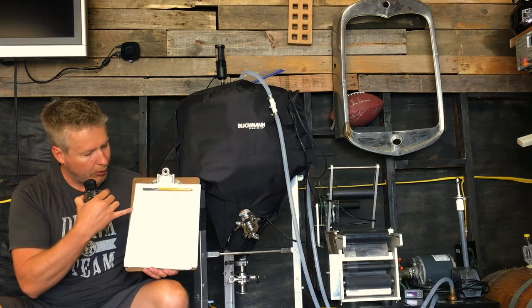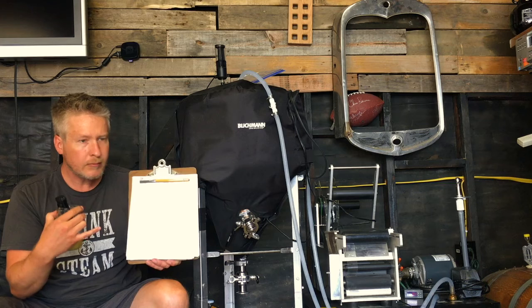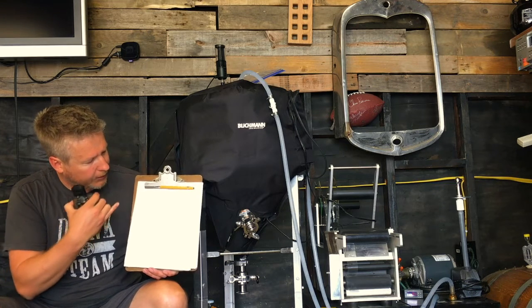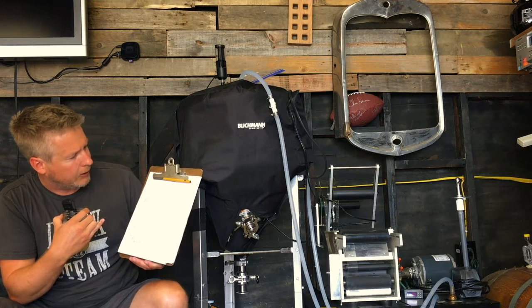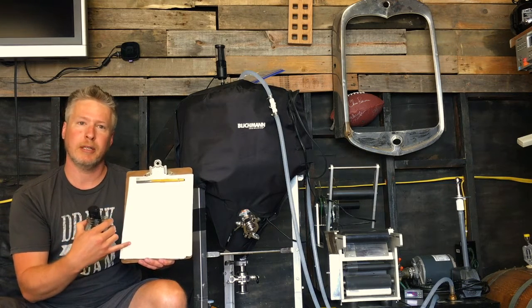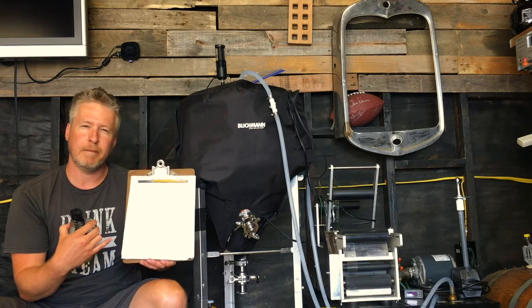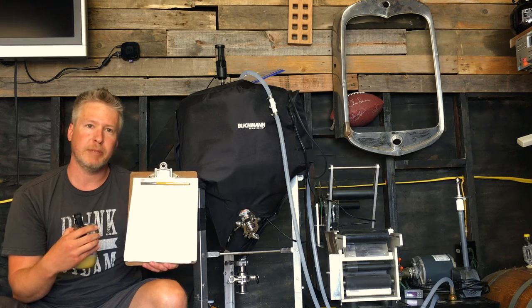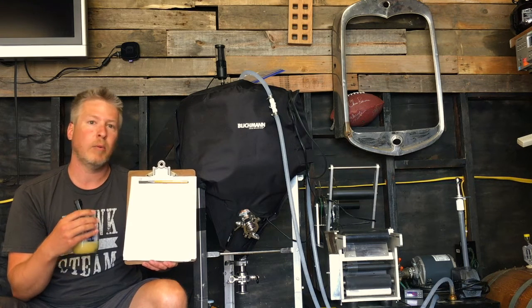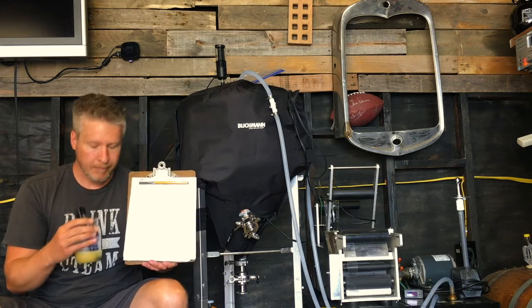Beers like this, I'll do a fermentation curve on, so basically a daily sample, roughly the same time of the day. The reason being is this was a Kveik beer with the new Juggernaut, and I wanted to see how quickly it was pulling down to terminal, what that curve was, and what the pH was. Levi from Long Beach Beer Lab has a lot of notes out there on the Milk the Funk forum on how pH is important to Kveik beers.